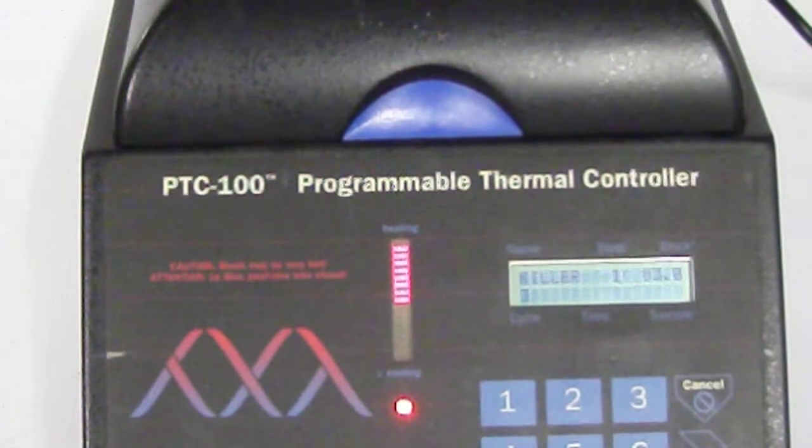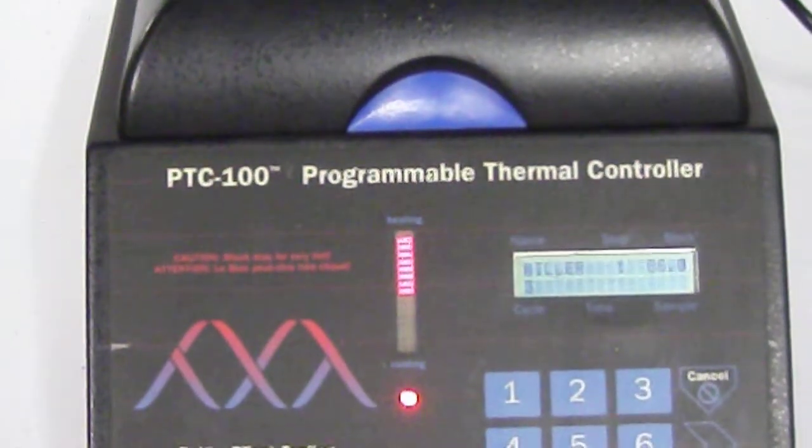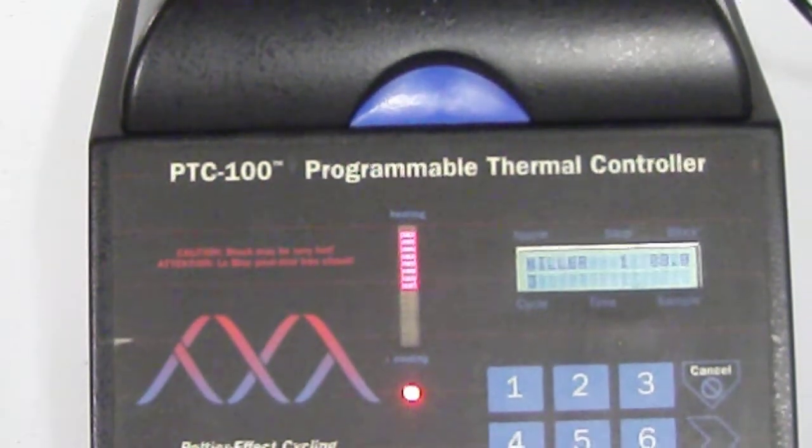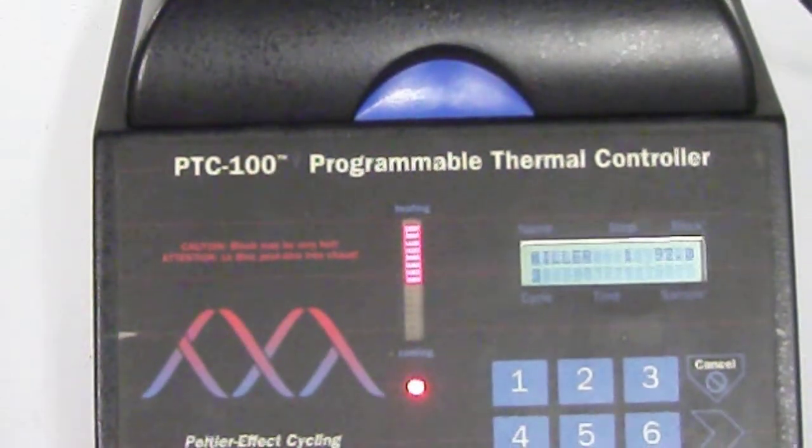Any sequence of temperatures can be cycled up to 10,000 times, including below ambient temperatures. This feature allows for refrigeration after an unattended run.